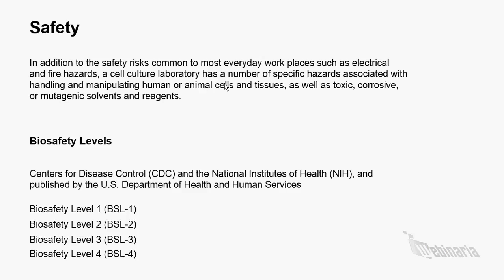BSL2 is appropriate for moderate risk agents known to cause human disease of varying severity by ingestion or through mucous membrane exposure. Most cell culture labs should be at least BSL2, but the exact requirement depends upon the cell line used and the type of work conducted. Biosafety level 3 is for indigenous or exotic agents with a known potential for aerosol transmission and for agents that may cause serious and potentially lethal infections.